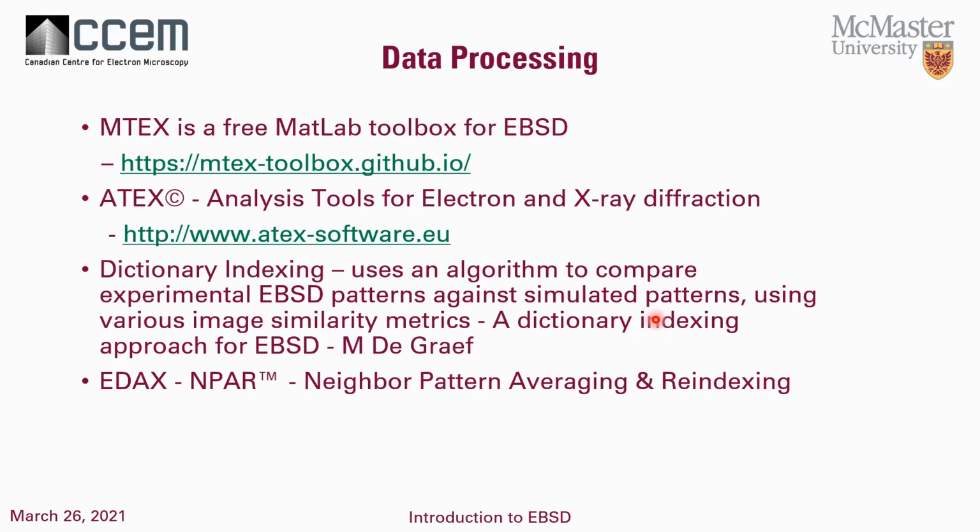There are also tools available for data processing, not from the various manufacturers. MTEX is a free MATLAB toolbox for EBSD. So very useful, a lot of things there. It allows you a little more freedom in doing things and adjusting things.